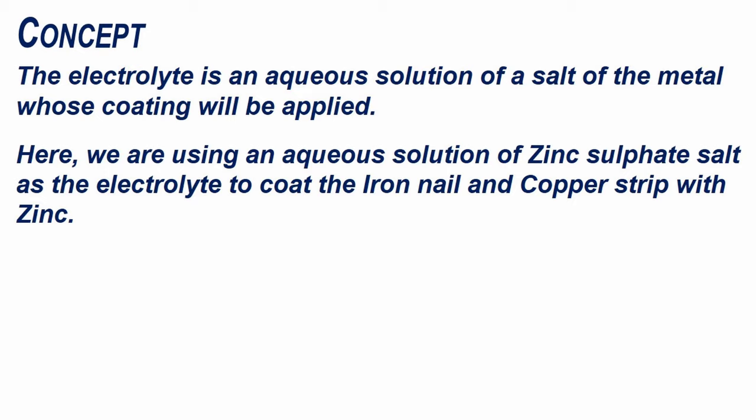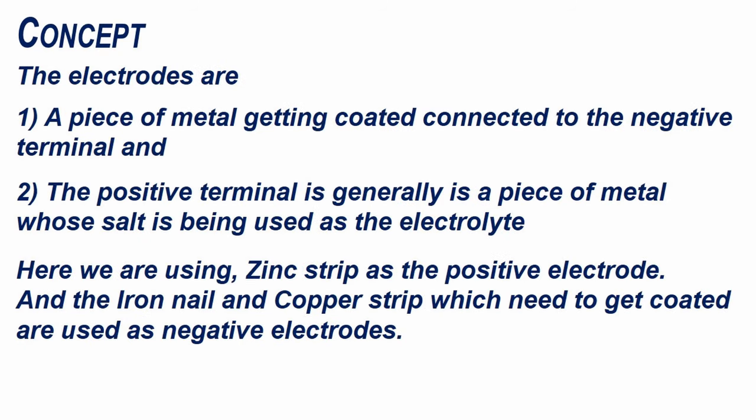Here we are using an aqueous solution of zinc sulfate salt as the electrolyte to coat the iron nail and copper strip with zinc. The electrodes are a piece of metal getting coated connected to the negative terminal, and the positive terminal is generally a piece of metal whose salt is being used as an electrolyte. Here we are using a zinc strip as the positive electrode, and the iron nail and copper strip which need to get coated are used as negative electrodes.